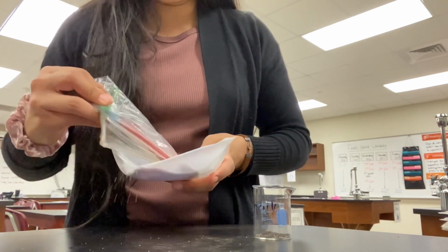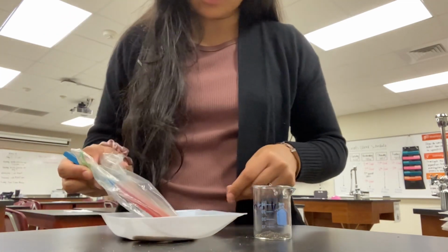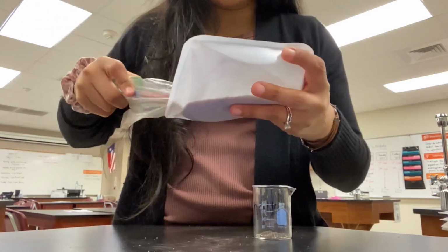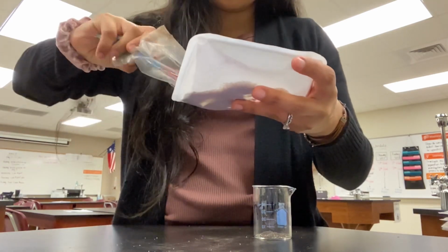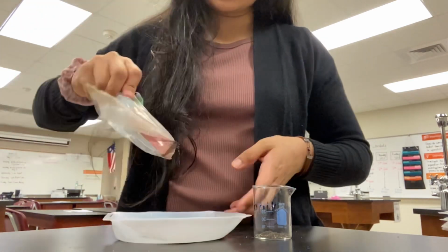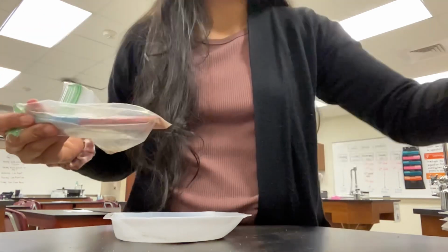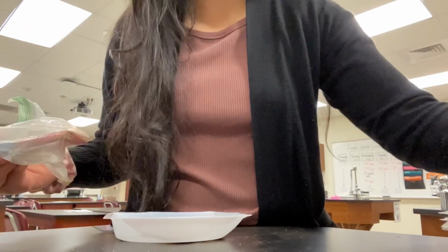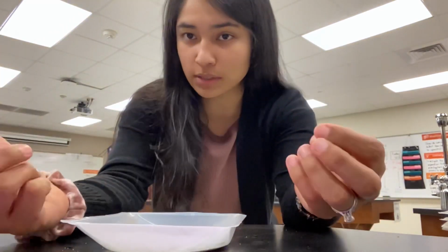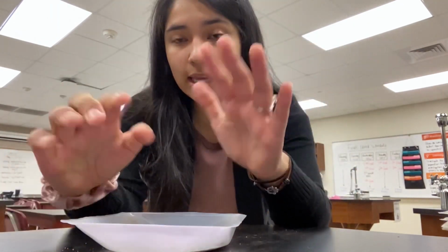I'm going through my sample with the magnet, making sure that all of my iron is out. I'll probably do one more just to make sure. All right, so see, the last one is barely anything. That is a sign that we're almost done with that. Okay, so I have my iron in here now. So that's been separated. Then, based on what I've talked about, we still have the sand, the pepper, and the ionic compounds in the mixture.